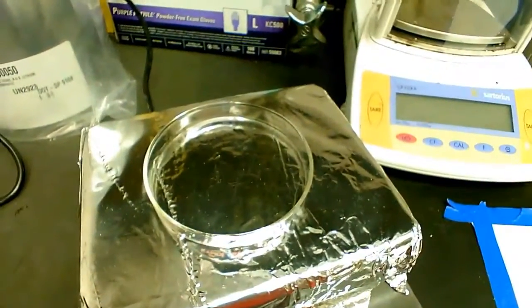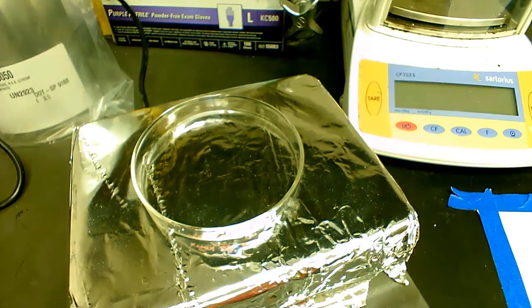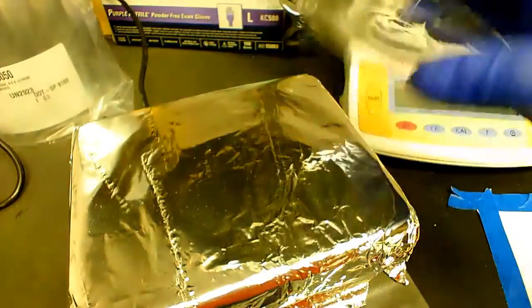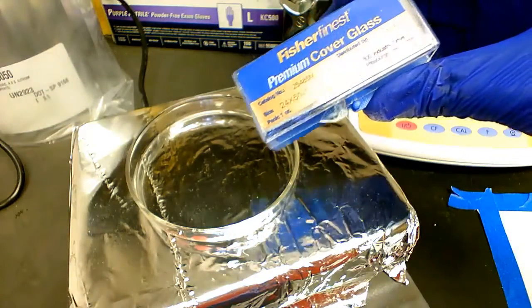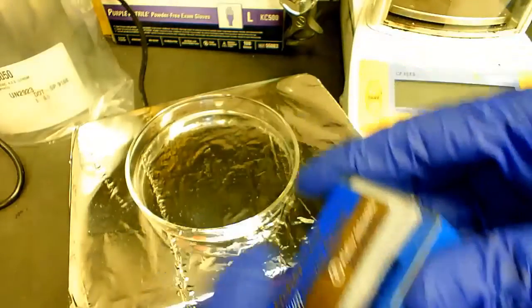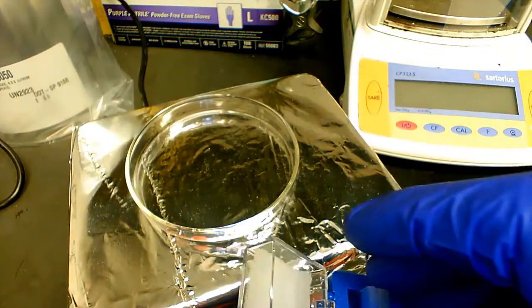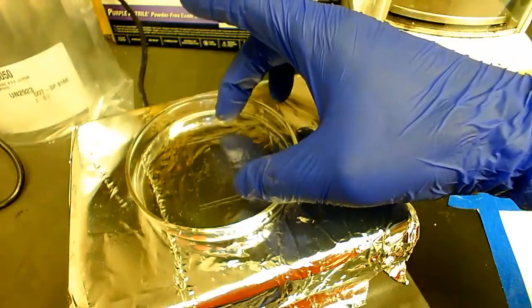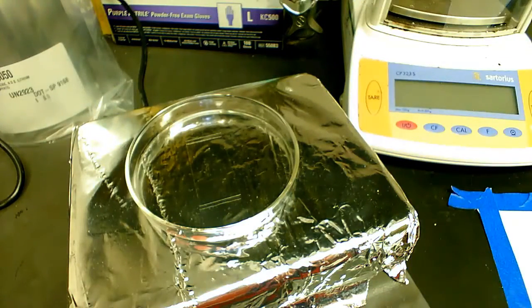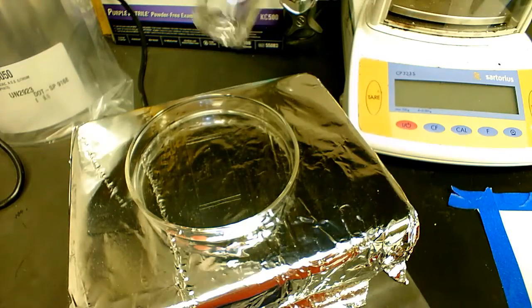And next you're gonna need to put a clean glass petri dish on the hot plate, and then next you're gonna take a premium cover glass and put that on the petri dish, like that.